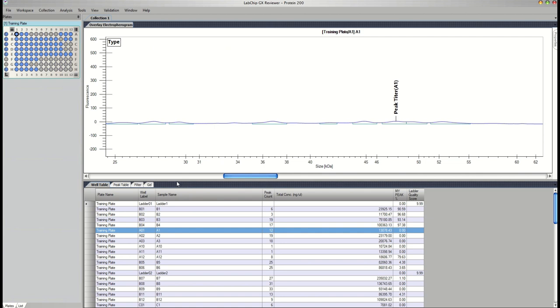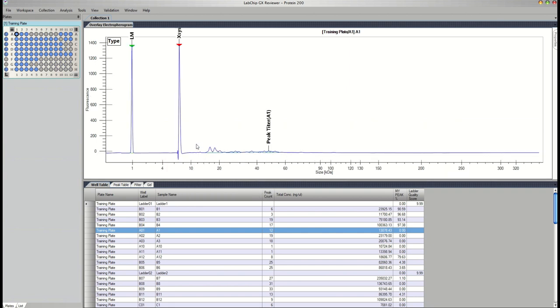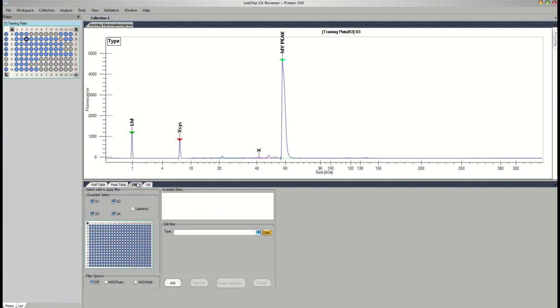During high throughput runs, we may be looking for specific metrics in our data. Perhaps that is the presence of a certain peak in the samples, or it could be a concentration or percent purity that is needed to be attained. By setting up a filter, we can find the wells in our samples that meet these criteria without having to click through our entire plate. Let's set up some filters on this data to see what we're talking about.